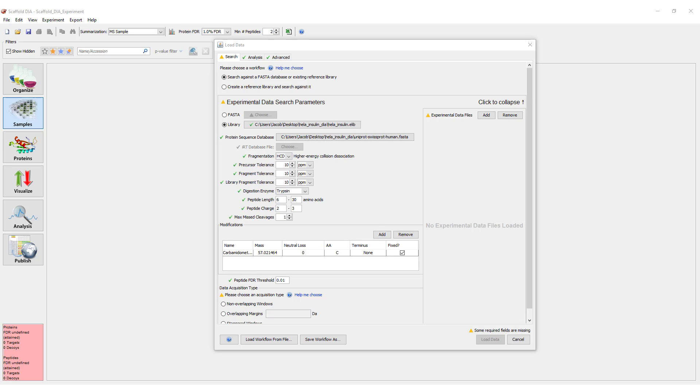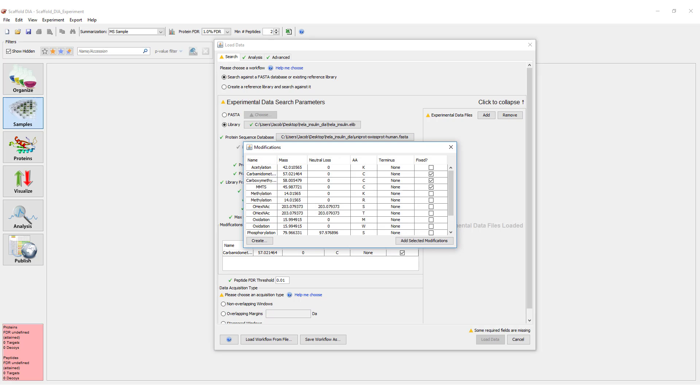Next, any modifications you would like to be included in the search should be added. By default, carbamidomethylation of C is included as a fixed mod. To add a mod, click on the Add button. This will bring up a list of common modifications to choose from. Select a mod and click Add Selected Modification. If the mod is fixed, check the Fixed box.